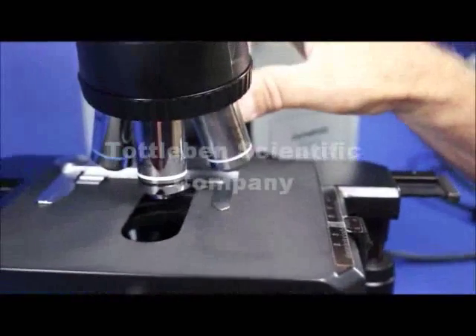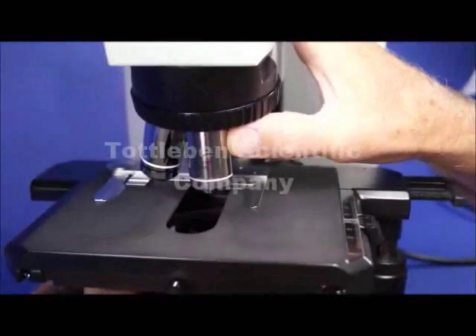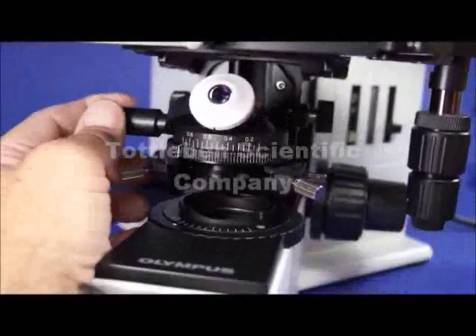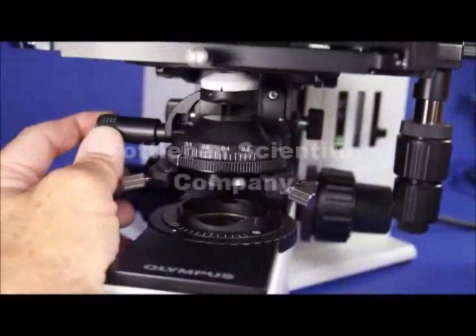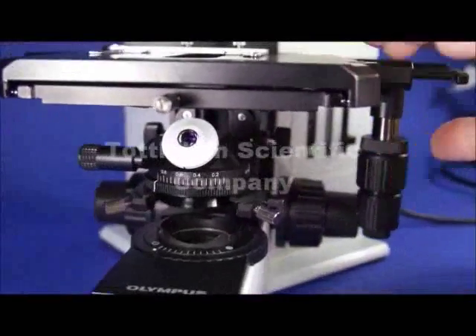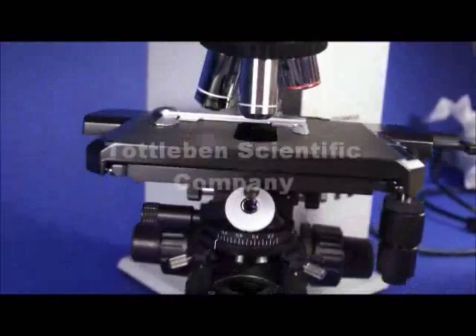Whenever you're using the 2x lens, we're going to show you exactly what you need to do with this condenser. This condenser needs to be flipped out — it's got a flip-top condenser. The reason you flip it out is because you have such a large field with the 2x lens, you want to fill the whole field so that you can see an entire field all at once.